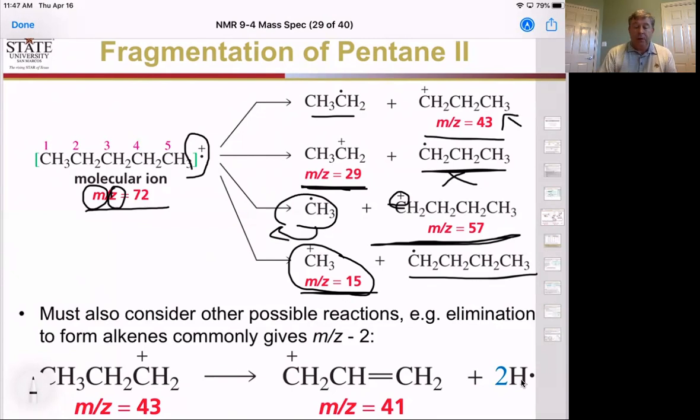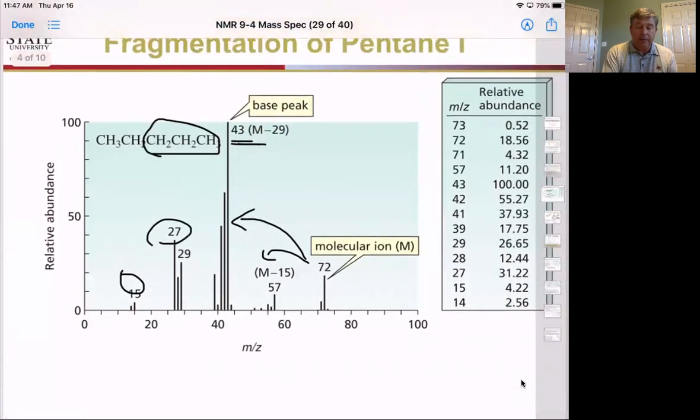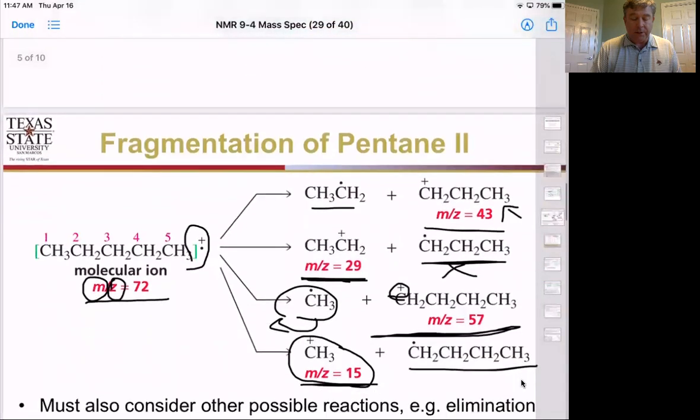Okay, so there's also a splitting in the system up here. If you'll notice, our base ion peak has a 43 and then another peak here, and that this has 2 peaks, specifically a 27 and a 29. Let's look at that little fragmentation here.